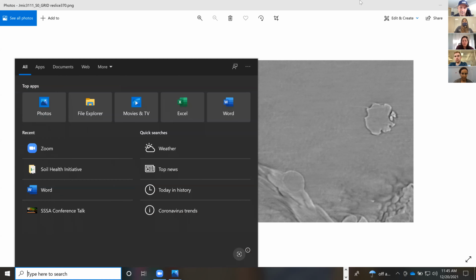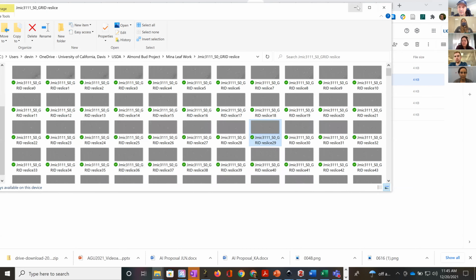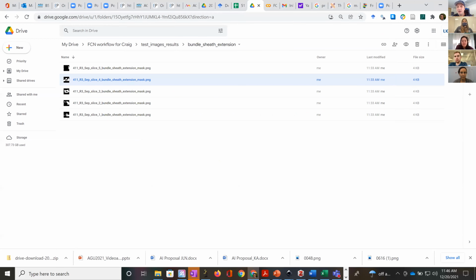Anyway, it's possible to run this model from multiple directions, and then you could stack the stacks to restack things. It's all possible with code, like it's just additive or subtractive things. But we really haven't done that. So there's still the hand annotation of the stomata, which is a pain, but I guess it is what it is. If you want to work on that, I'm happy to try to get that feature running. It's just a little bit of a challenge with the deep learning code.